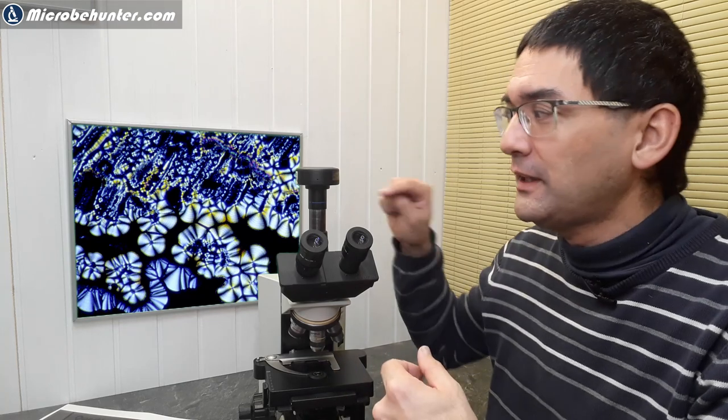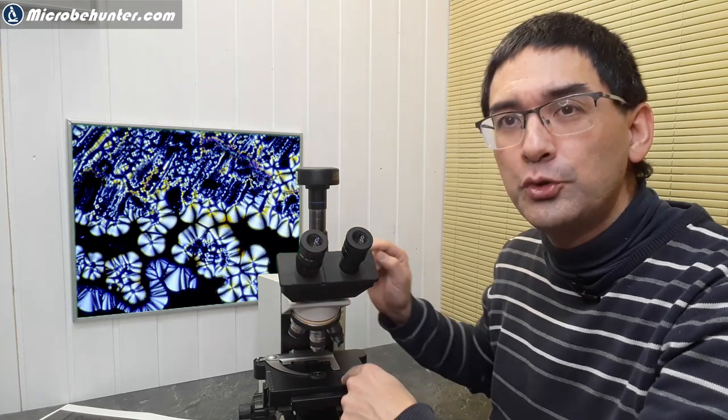So the question is, what magnification do I have now on the camera? Now the 0.3 or 0.5 magnification here is necessary, so that the image that is projected from the objective is resized in such a way that it fits nicely on the sensor.